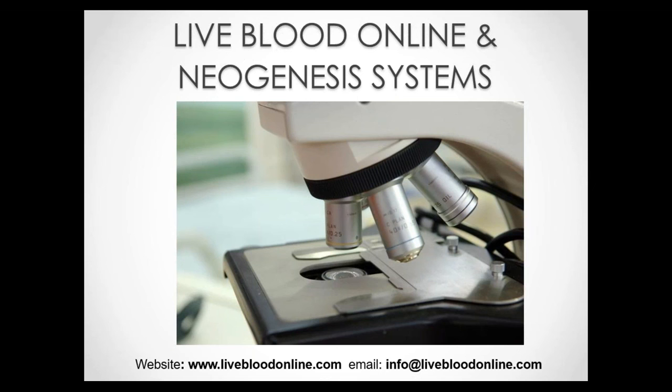Right, that is a very good question, and one that often tends to come up because we are looking at blood, and people expect us to see specific things with blood analysis. But it's important to mention that blood analysis, live blood analysis, is not used as a diagnostic tool. Although there are some indications for specific disease processes that can be seen in the blood, because there is a fair degree of overlap with standard hematology, it's not really meant to be used to diagnose any specific disease. Now, in cases where indicators of a specific disease are seen, one would still need to follow the normal investigations and procedures to diagnose the disease.